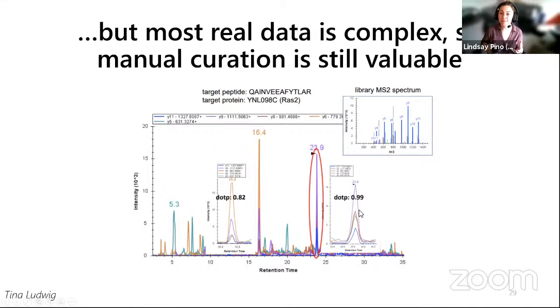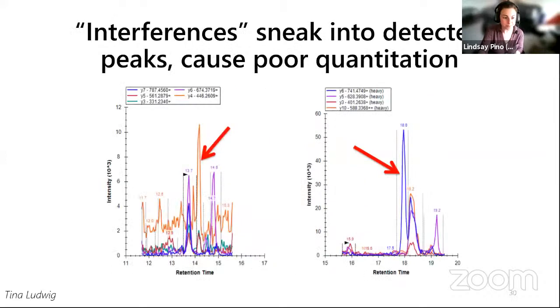So this is kind of what these softwares are doing when we're analyzing DIA data. It's taking all of these things together. If you have a library spectra, it can use that library spectra, match it within your own data and say, oh, even though this data is really messy, this peak group over here looks a lot closer to the library. And this is why it's so important, if you have a library, that it matches as close as possible to your actual samples, because the fragmentation and interferences in your samples might be different, and the same instrument, because the fragmentation energy, like Brian mentioned, is a little bit specific to each instrument.